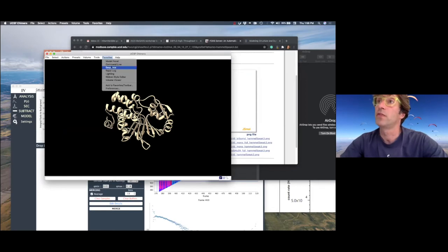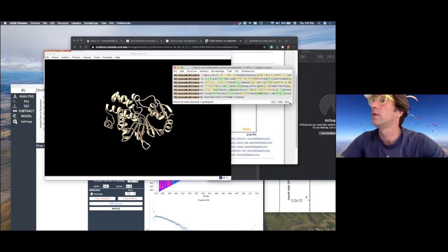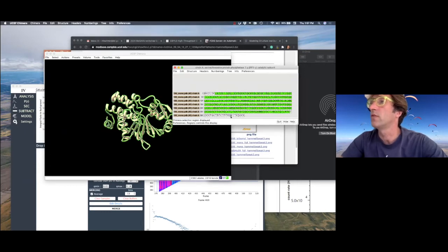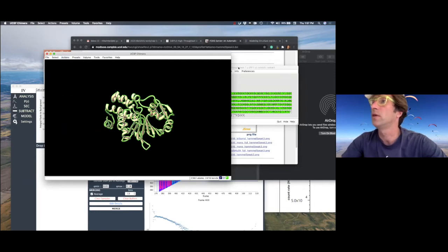So we open the sequence for this molecule. Okay, this is the sequence. And when you select the sequence, you see there are some residues at the beginning and at the end that are missing. So in a simple way, by action, you go here, and in Structure, I'm sorry, it's here.